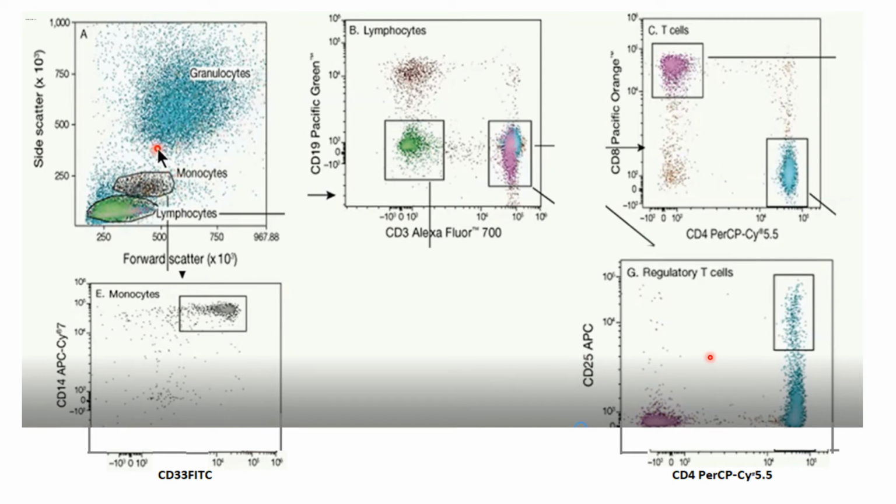Now you can also analyze how many regulatory T cells are present in a given sample. So it's a very good application of immunophenotyping when you are having autoimmunity, or if you want to analyze stem cells, or differentiated cells, embryonic stem cells. You just need to have knowledge of specific proteins present on these cells, use antibodies against those proteins, and you will get the exact number of how many cells are present in a particular sample of your interest.